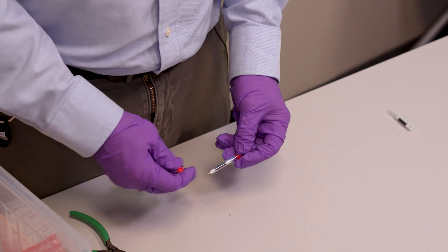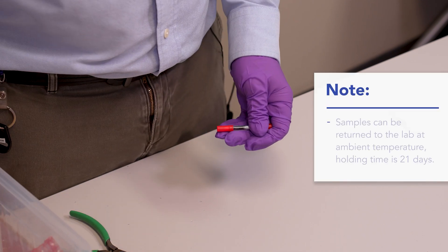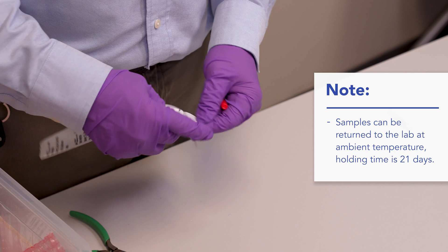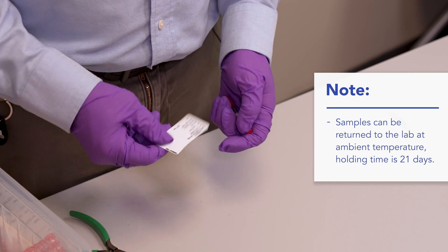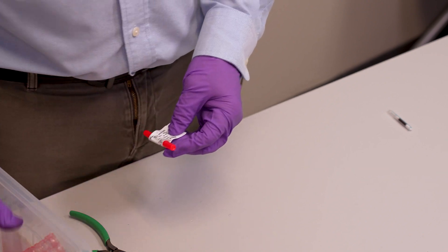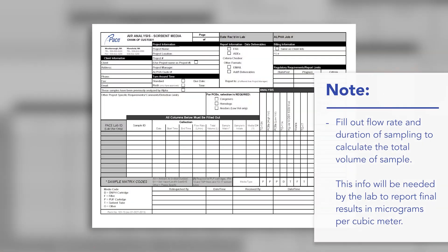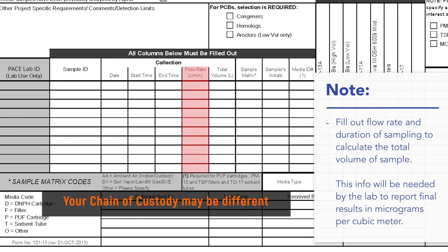At that point you want to fill out your sampling label and attach that to the tube. Then on the chain of custody, you'll need to fill out the areas with your flow rate and duration of sampling. The laboratory will need to confirm that so they can calculate the total volume of sample that will be needed to report final results in micrograms per cubic meter.